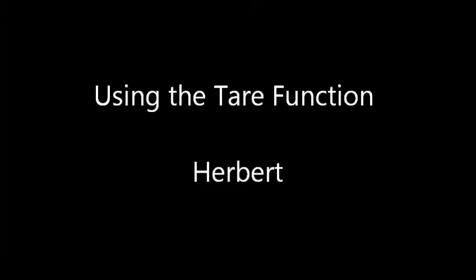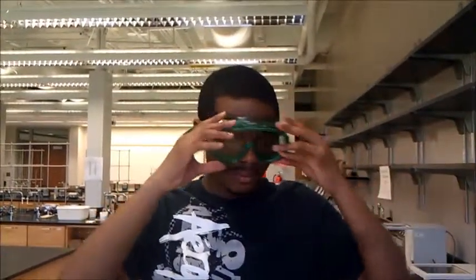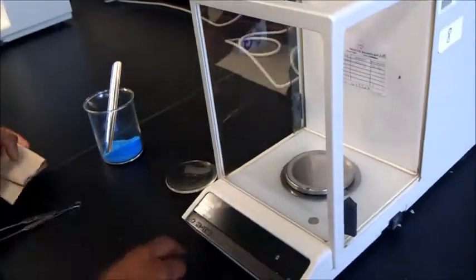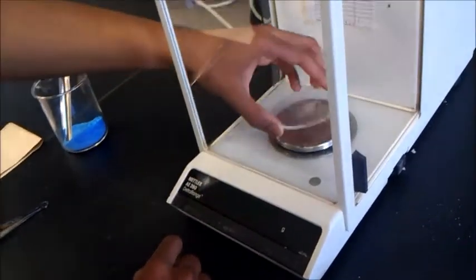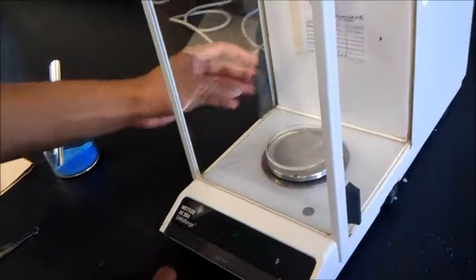And now Herbert will also show us how to use the balance by tare. At this point, I will note that it is important to use the same balance throughout an experiment. This is so that any incongruities that a certain balance might have with other balances do not affect the results of your experiment.